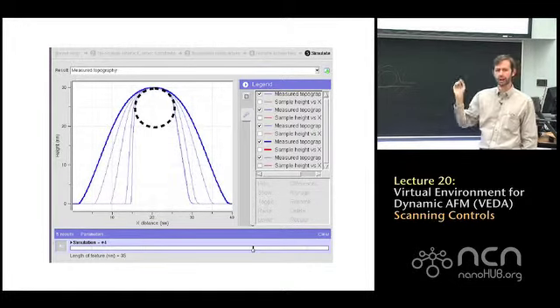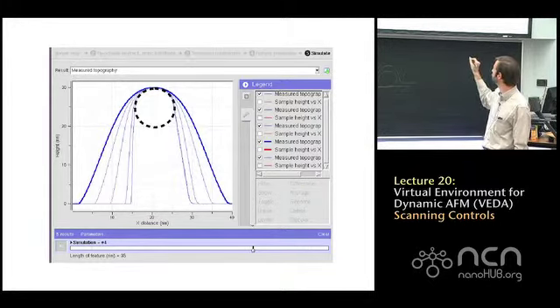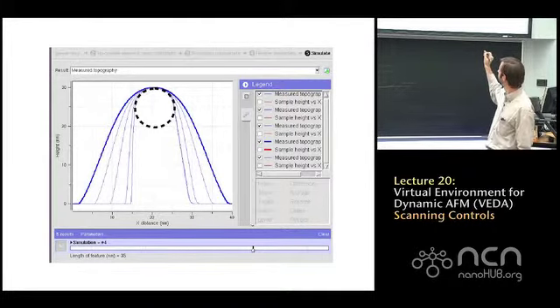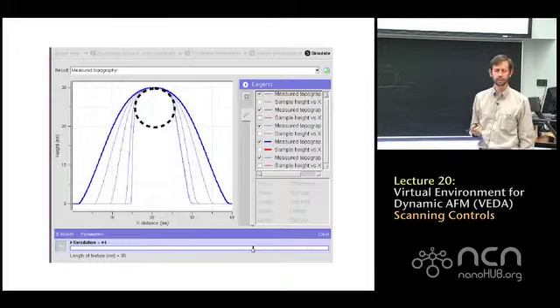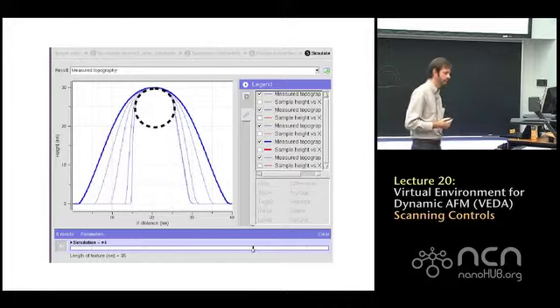So this is, I'm sorry, I've pre-run this. It's a series of simulations as I decrease the tip size. I just did 3 live. Here's a bunch of them. So for the smallest one, decrease the feature size. The smallest one at the top, it looks like a circle with a radius of 5 nanometers. So what this means is, instead of the tip imaging the sample, imaging the feature is actually imaging our tip. Does that make sense?